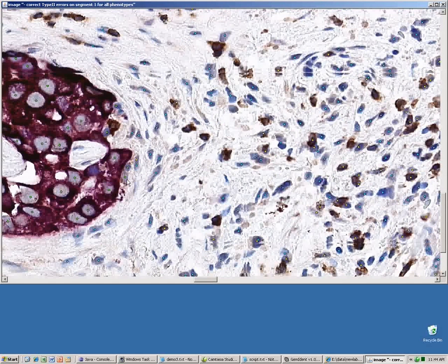Here's a couple. Deletions here will be reflected in the global image. For the most accurate analysis, the entire global image must be checked.